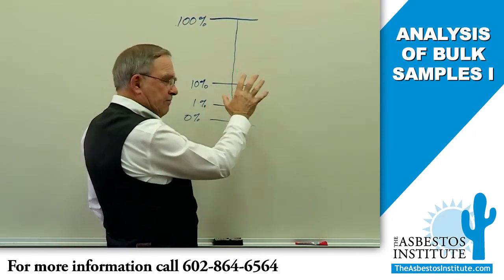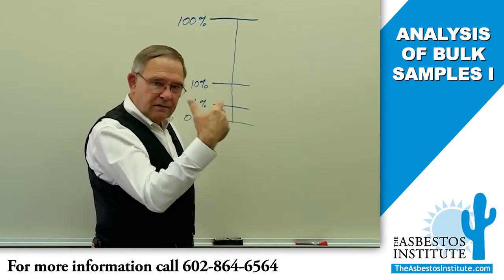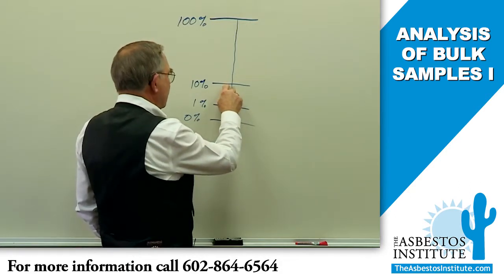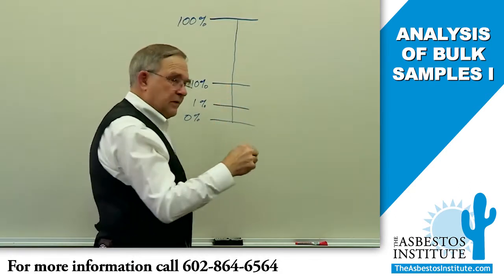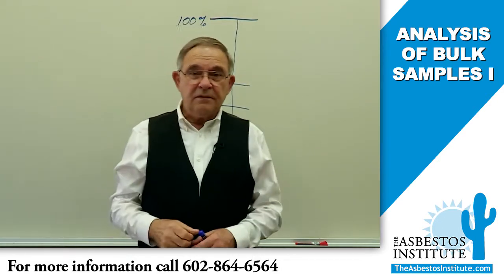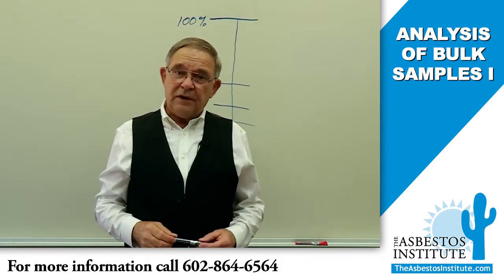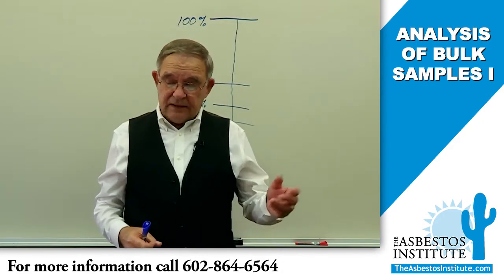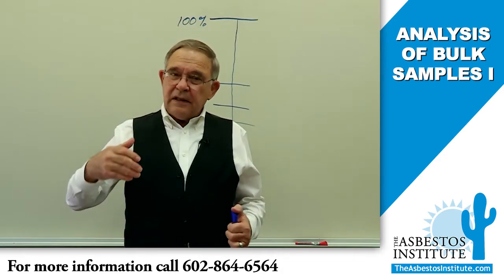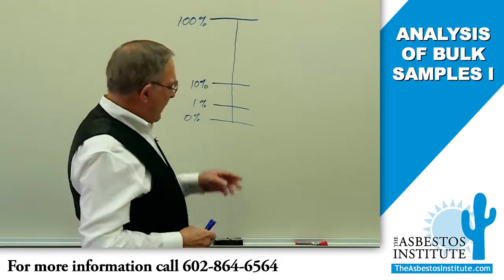We use PLM because it's fast and it's cheap, and it's the basic regulatory requirement under AHERA, okay? Below 10% though, by PLM, most experts would say is nothing better than guesswork. Even though we've had 25 or 30 years of analytical experience in this country using PLM, and we have some very good analysts, still, the method itself doesn't lend itself to be accurate enough, even with the most experienced analyst, to be accurate below that level.